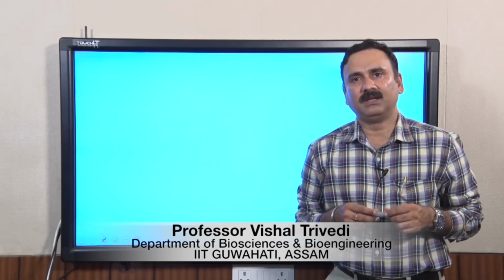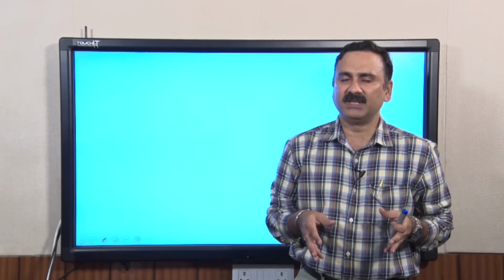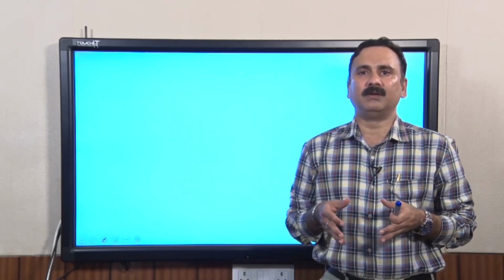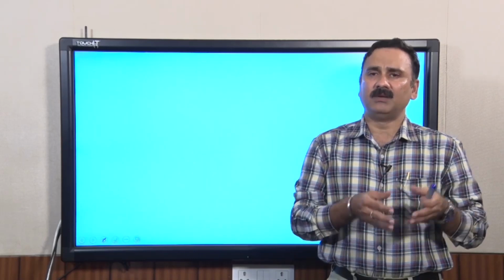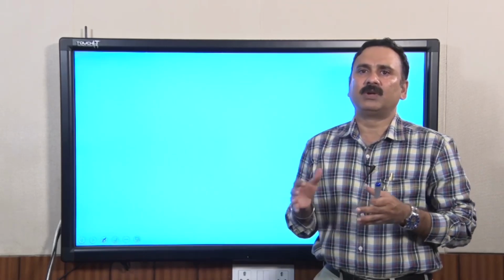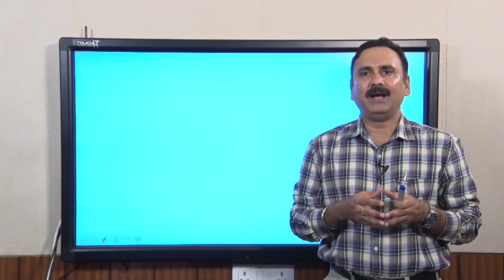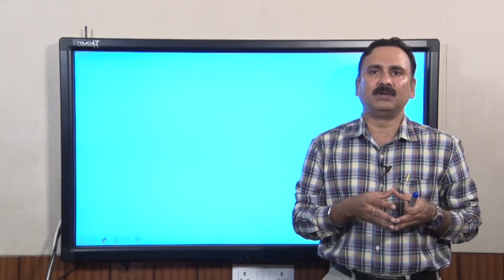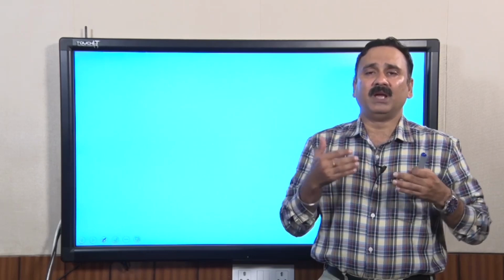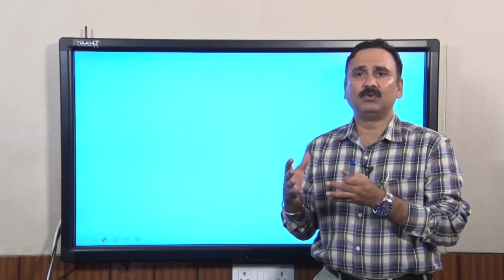And what we were discussing in the previous two lectures is electrophoresis, the basic principle, as well as how to perform the electrophoresis. Subsequently, in the previous lecture we also discussed that once you get the image, you can do a lot of analysis with the help of different types of software which are available. And in a detailed demo in the last lecture, we showed how the software can help you analyze that particular image, and how that analysis can help you answer many questions.